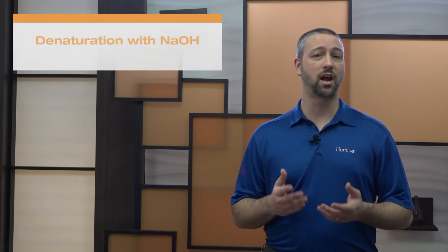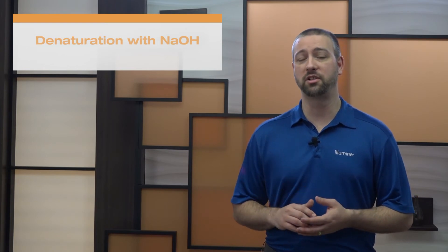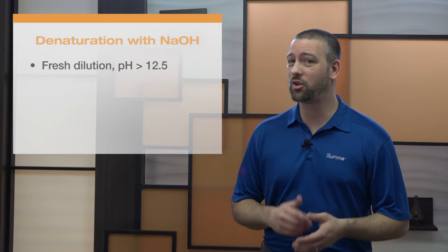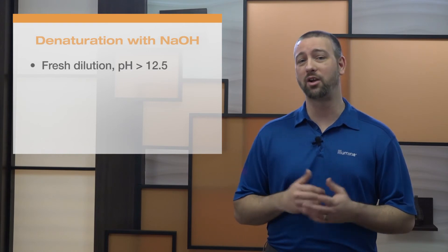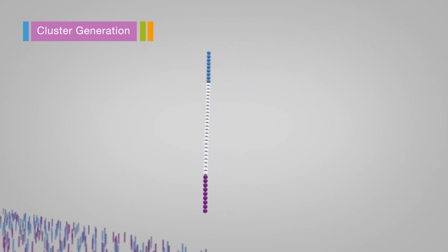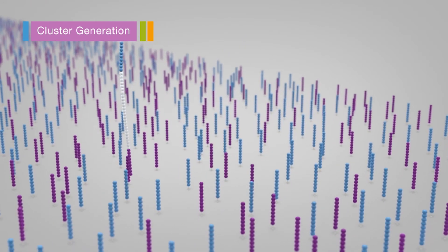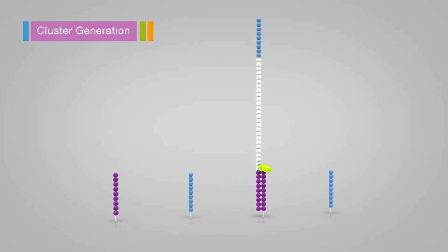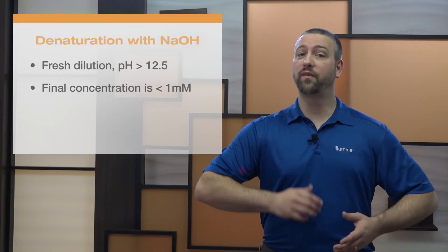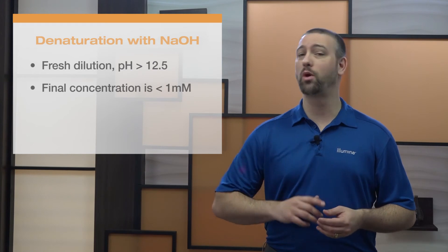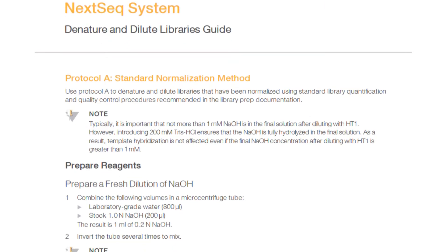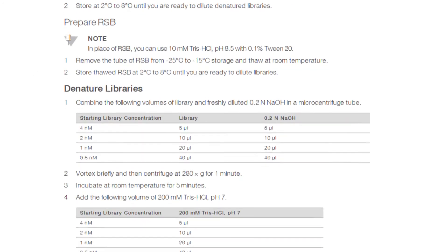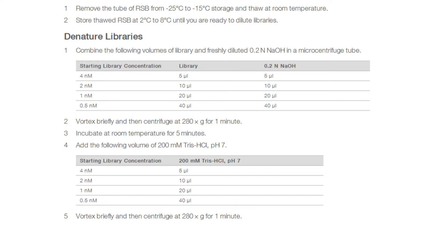Another consideration in arriving at final loading concentration is denaturation. Sequencing libraries commonly use sodium hydroxide to denature the library to prepare hybridization to a flow cell. It is important to ensure that fresh sodium hydroxide with a pH of 12.5 or greater is used. Sodium hydroxide that is not freshly diluted can acidify and impair denaturation. Libraries with incomplete denaturation have fewer strands available to bind and cluster on the flow cell, reducing cluster density. Also, ensure the final concentration of sodium hydroxide in the diluted libraries is less than 1 millimolar, as excess sodium hydroxide can inhibit cluster formation. The NexSeq 550 denature and dilution guide uses Tris-HCl to neutralize the pH, and this process can be adopted for other Illumina instruments if needed.